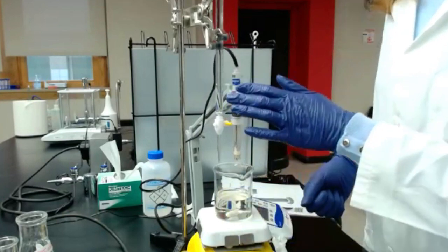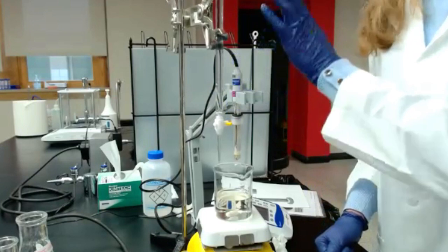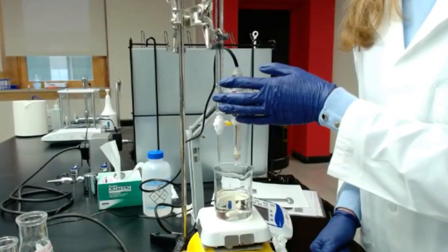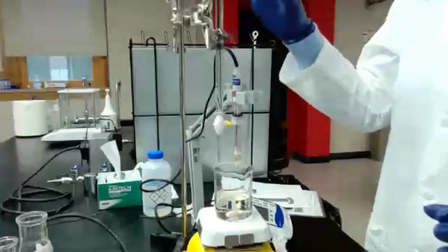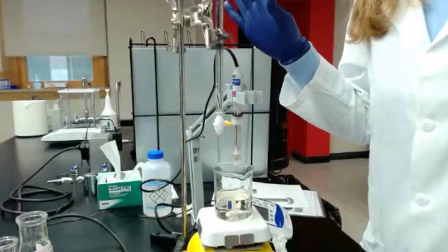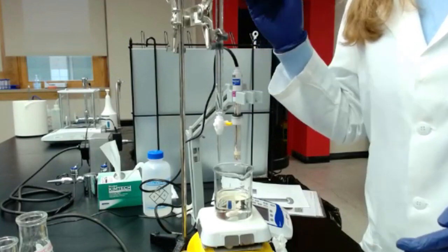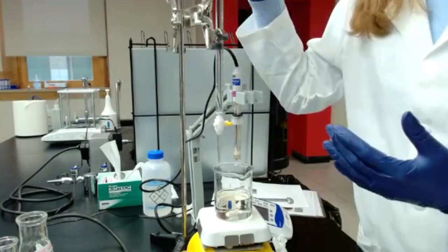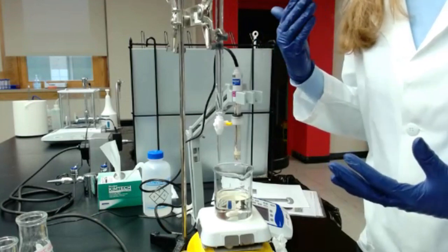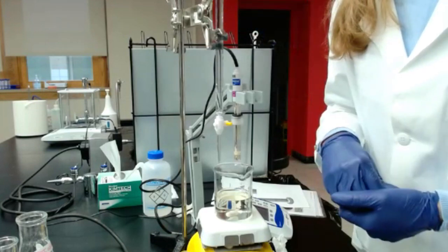So I've got a 50 milliliter burette. That is correct, 50 milliliter burette. You can have a 25 milliliter burette. That is fine. The volume really doesn't influence anything. Just if you plan to do a lot of different analysis, it's good to have a big burette, a larger volume, because you can do multiple analysis with the same solution of sodium hydroxide.